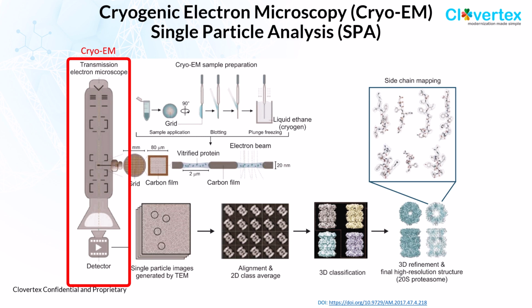And inside of this, the protein will be embedded so that it will be protected from the vacuum condition, so that the protein won't be broken by the vacuum condition.